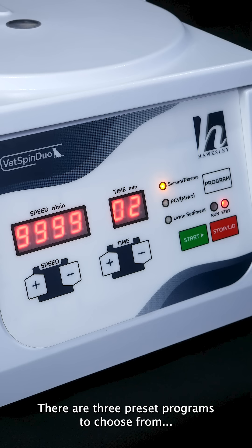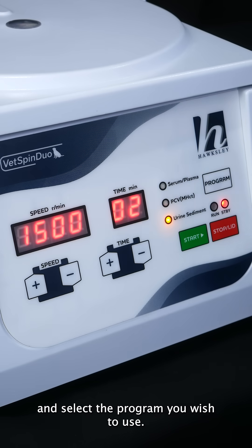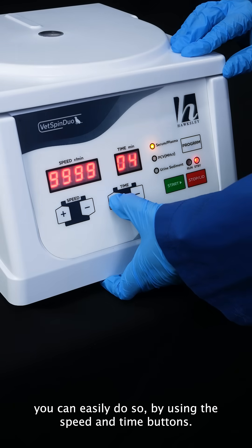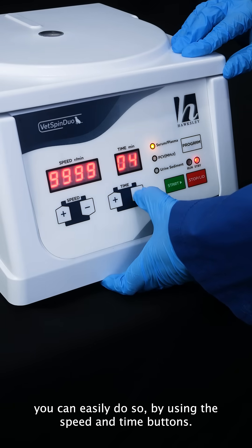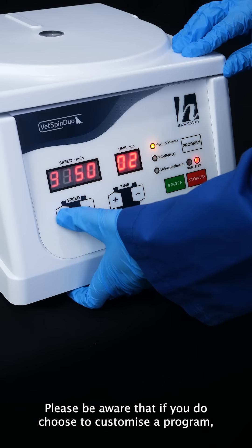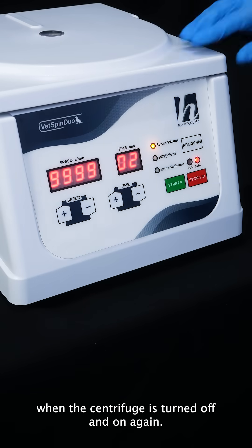There are three preset programs to choose from: plasma, hematocrit and urine sediment. Press the program button to cycle between each preset and select the program you wish to use. If you'd like to adjust the settings on these, you can easily do so by using the speed and time buttons. Please be aware that if you do choose to customize a program, this will be reset when the centrifuge is turned off and on again.